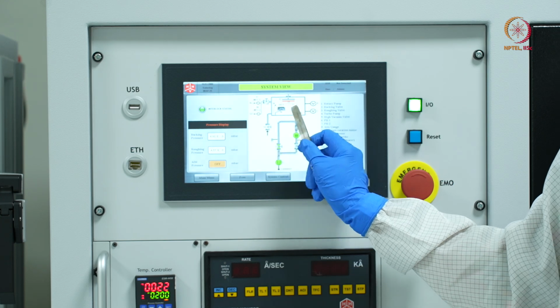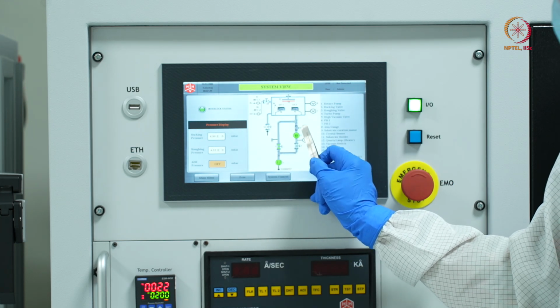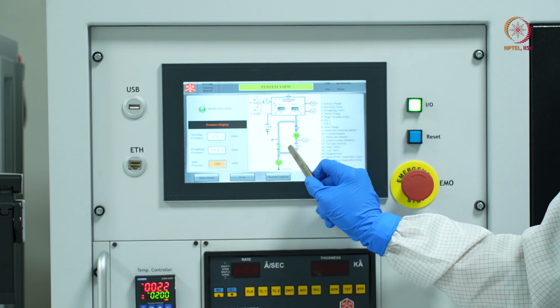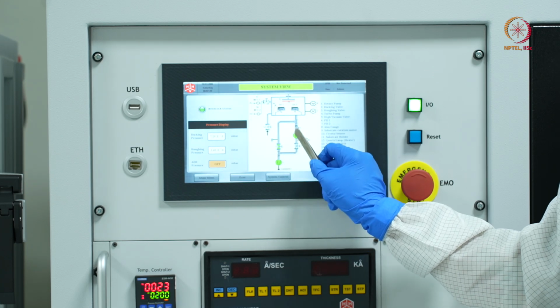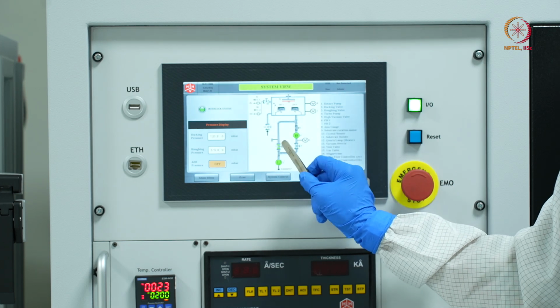Right now, the chamber pressure has not reached 10 to the power minus 3, so you can see this valve is closed, this valve is open, and these two valves are open. This line is already evacuated, and through this valve my chamber is getting evacuated.